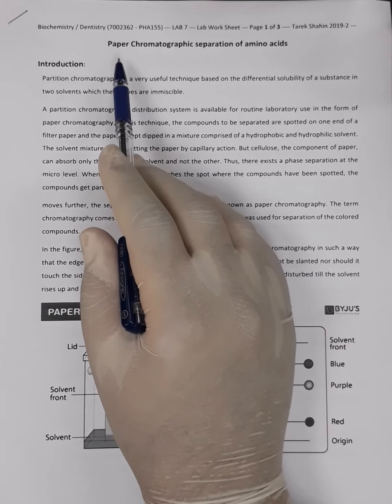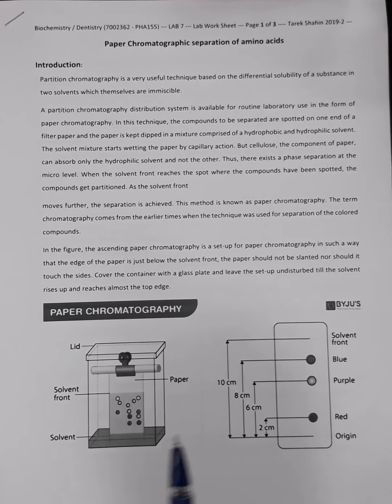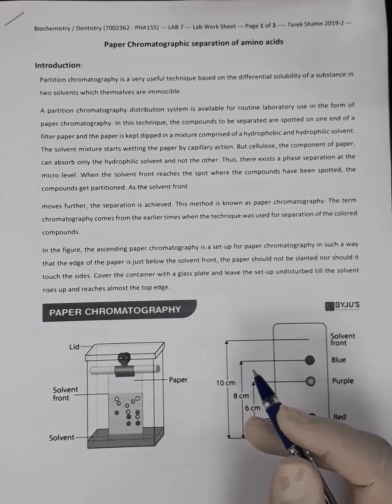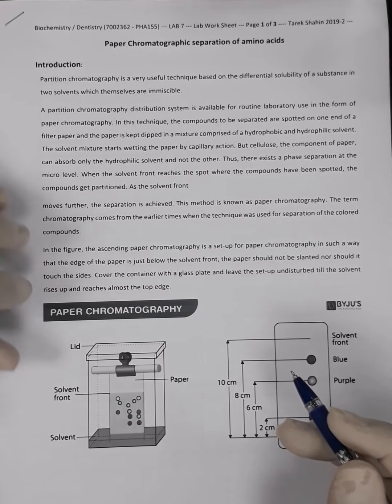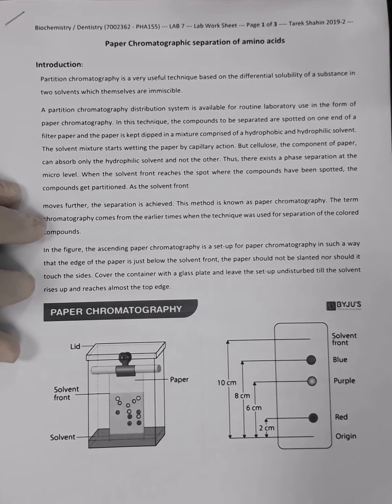Today, inshallah, we are going to have a new topic which is about paper chromatographic separation of amino acids. We explained the theoretical part of this experiment in the practical online session. We had it through WebEx, and I'm going to give you a quick revision before we start the practical part.